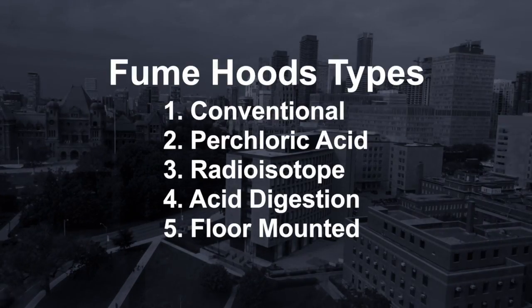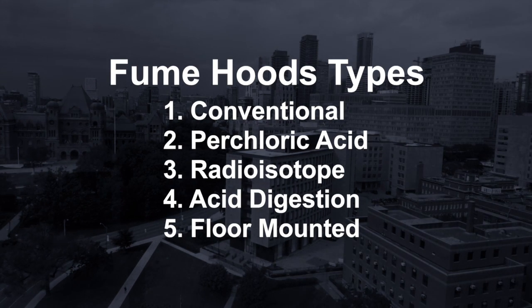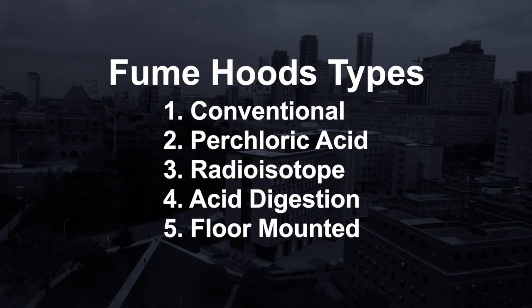There are various types of fume hoods and specially designed ones for specific applications. When you're purchasing a fume hood, speak with the vendor on what types of chemicals and activities will be conducted so that you receive the correct design.